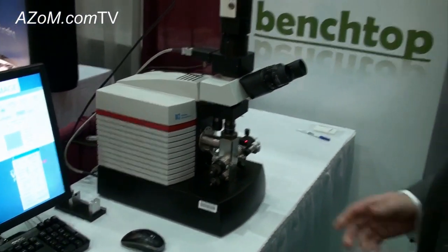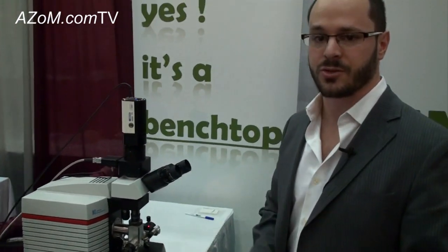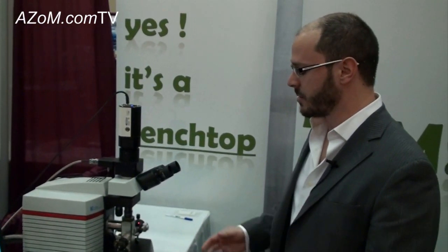What really enables us to miniaturize the entire system is the fact that we're using a low voltage field emission electron source. The TEM operates at 5kV, which is really unique. Since it is multimodal, it's very well placed as an educational tool. It's very easy to operate, very quick to learn, and fast to go from sample to image. But since it has very high resolution capabilities, it really is a well-suited research tool as well.